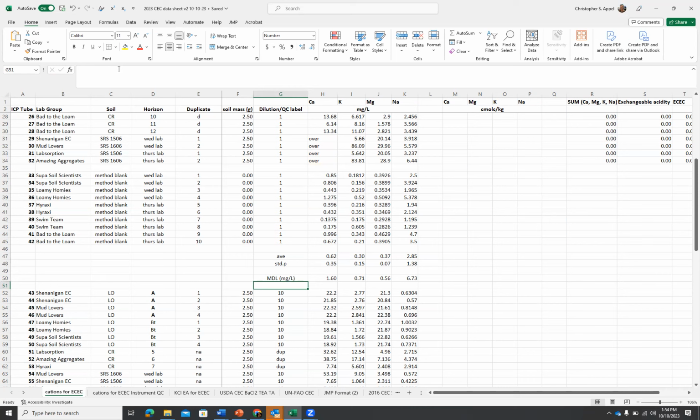Okay. What's the equation for the STDEV.P? The equation for STDEV.P has the formula built in. So the acronym that they use is stdev.p, and it's just standard deviation. It's just calculating standard deviation of that population.